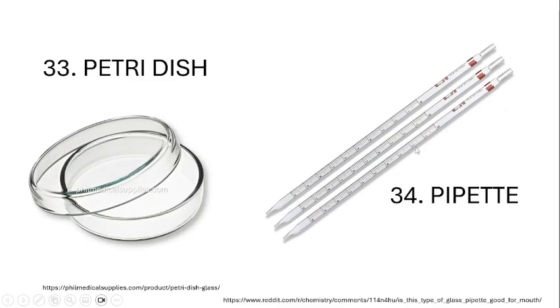Next, we have the pipette. So these are small, well, not small, but these are precise volumetric apparatus. So you have different graduations as well. So there are different types. So if you have 10 ml, you also have 5 ml. So it is used to measure and transfer small amounts of liquids.